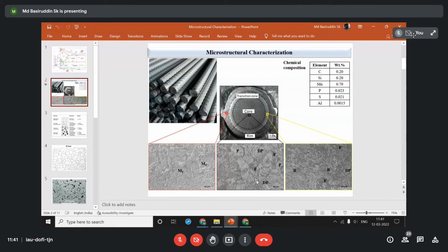Here you can see that at the center there is a white microstructure and a dark or gray microstructure. These are two different microstructures. I think the mechanical and production people may know about the pearlite and ferrite microstructures. If you know that, then you also know that ferrite is relatively soft compared to pearlite. And if we have martensite, as in this particular case, martensite has even higher hardness values. If you have mixed microstructures, the hardness would be at intermediate stages, not very soft, not very hard.